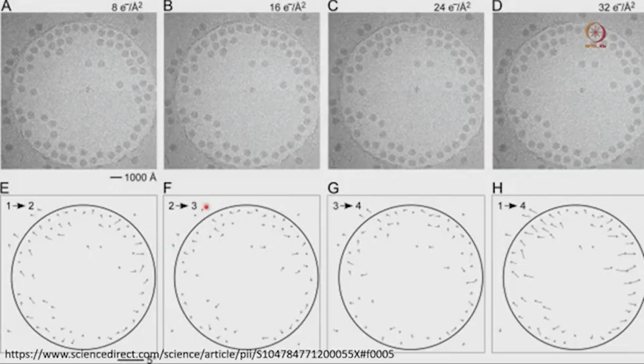This is the same image, we are targeting one particular area. If you consider that this is the carbon area as I mentioned, and this is the hole where virus particles are there. Now I am targeting this particular area to collect the image, because my sensor size can only image this much. It cannot image this entire hole, because we have to go to a very high mag and collect this data. So my sensor can capture only this much area.